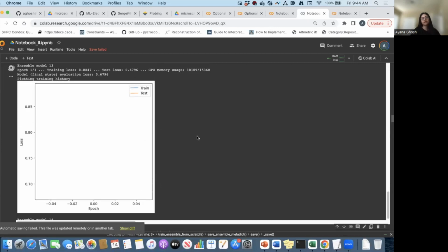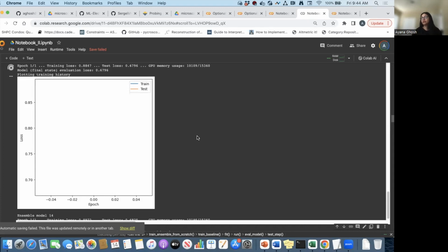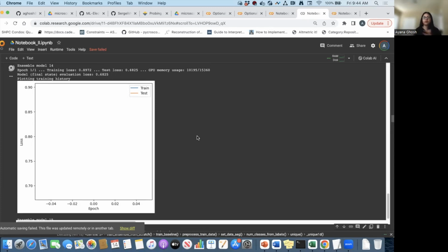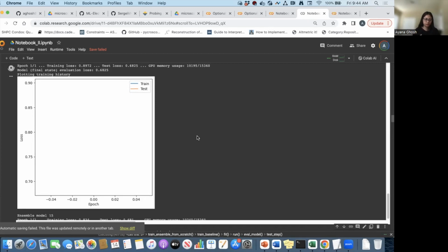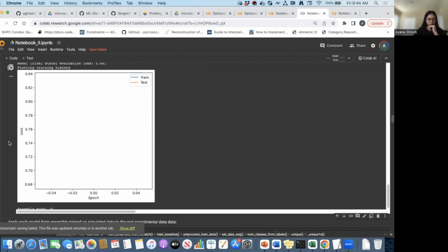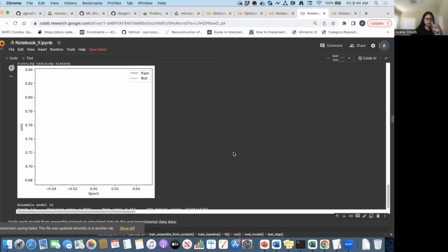Keep watching this space from our group. We are working on having some pre-trained models on MoS2 and those types of materials as well for everybody to use. Hopefully that will be coming to you, or we will make that available to you soon. The ones shown here are available as well, so you could try to see if you have some graphene type of data.